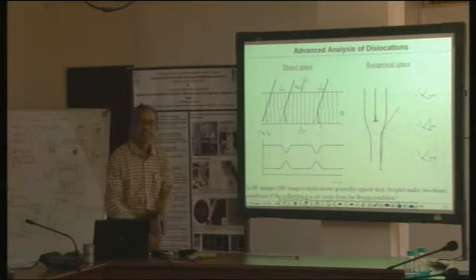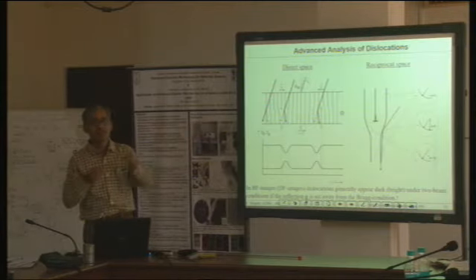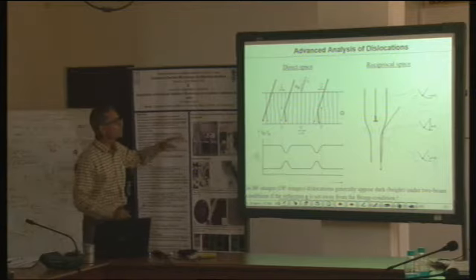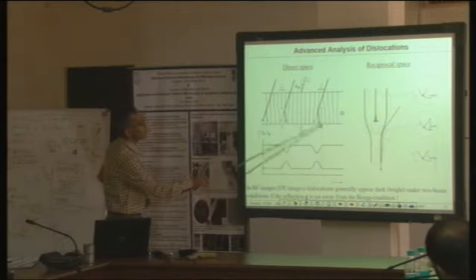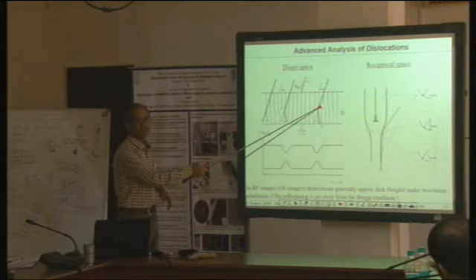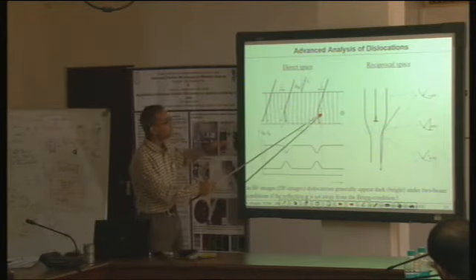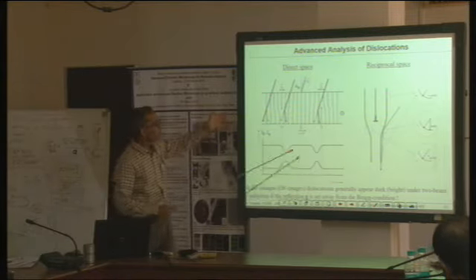Now, regarding dislocations, how do we measure them? Just as we applied this technique for the strain field around the quantum dots, similar principles apply. Suppose this is a dislocation, here an edge dislocation. A lattice plane has been inserted halfway through your sample, and you see how these lattice planes get bent around the core of the dislocation, and then you have to see where it satisfies the Bragg diffraction condition.